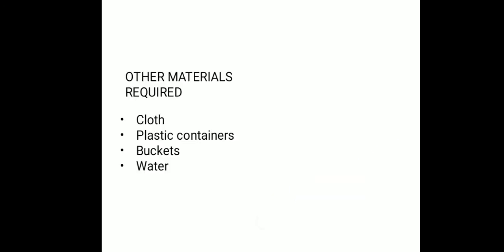The materials required are: we need to get wood ash, we need to get an egg, a heater. Preferably you should use an electric heater, and I'm using a coal heater. Other materials required are a cloth for filtration, plastic containers, buckets, and water.